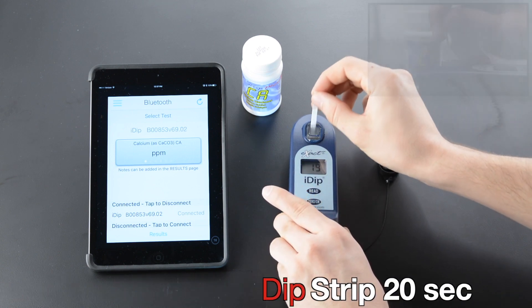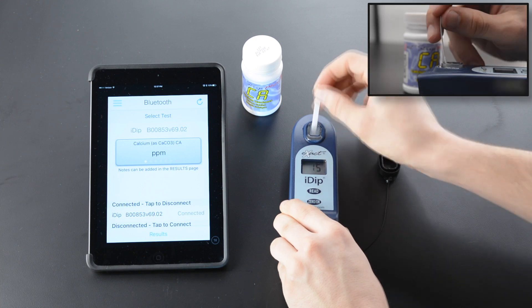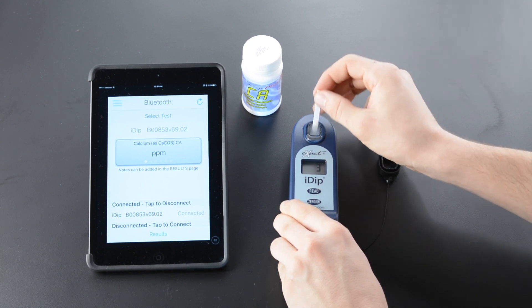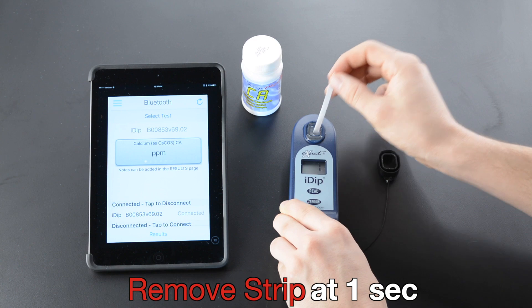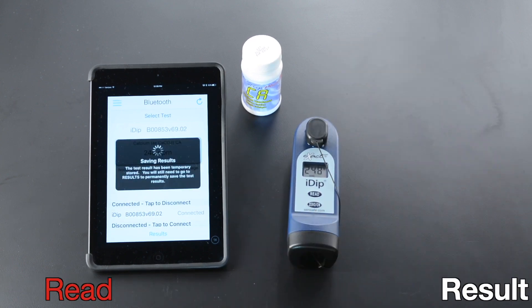Remove cap and press read. Dip strip 20 seconds at two strokes per second. Remove strip at one second. Replace cap. Read result.